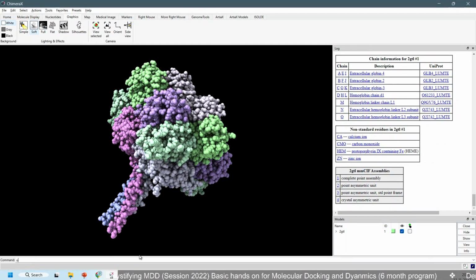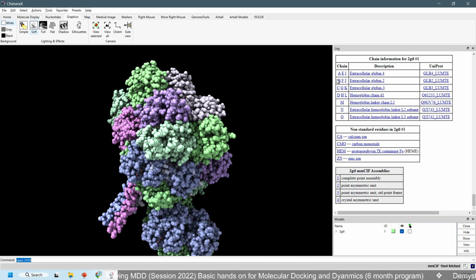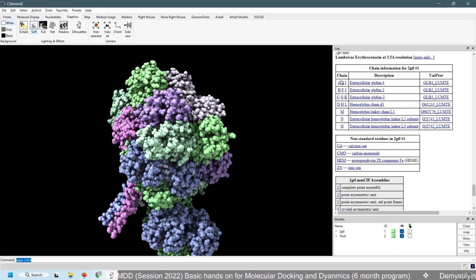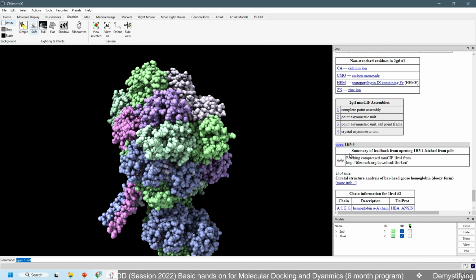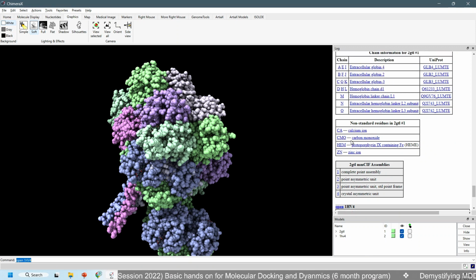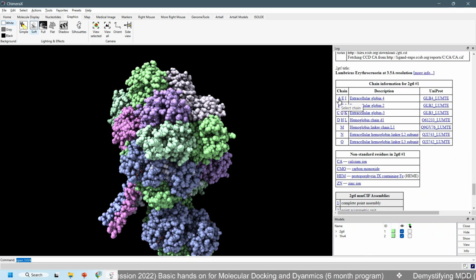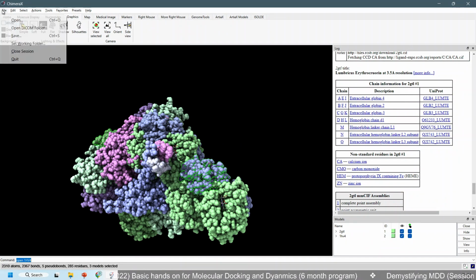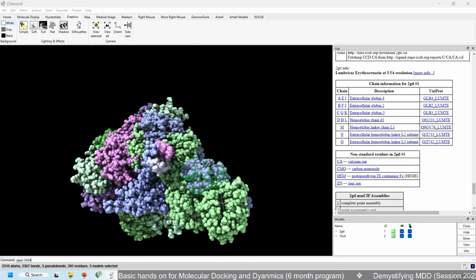This protein has many chains, chain A to O, and here we are seeing chains A to H are there. So I will compare chain A from structure 1, model 1. I have selected chain 1 and am saving it using the save option.